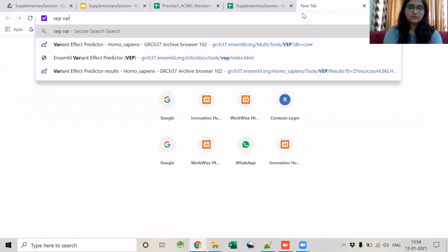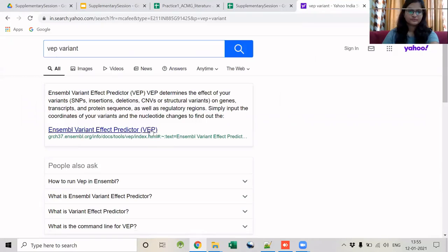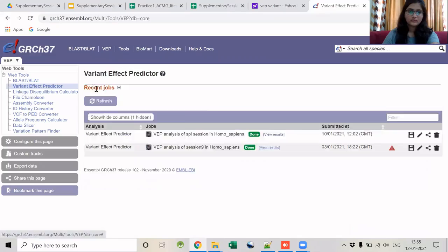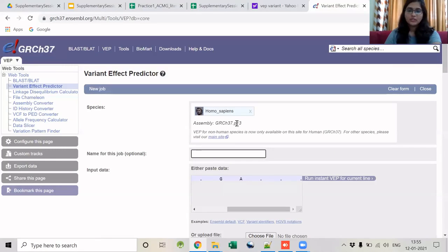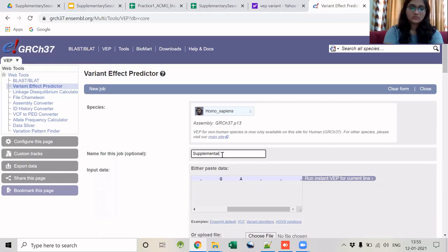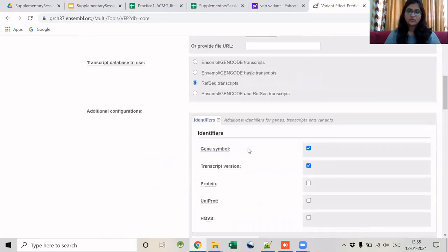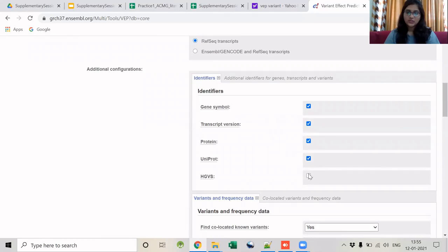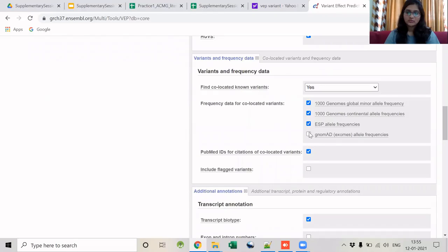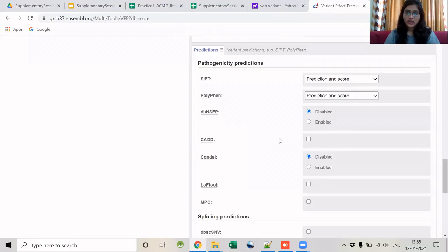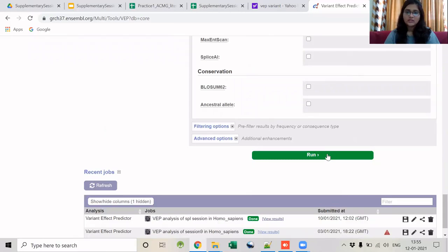Let us use VEP to annotate this variant. When using VEP, make sure you are using the right assembly version. After that, tick the radio button for RefSeq transcripts. Tick all the check boxes for allele frequencies, exon and intron numbers, and the CADD score of the variant, then click Run. No filtering options are needed.